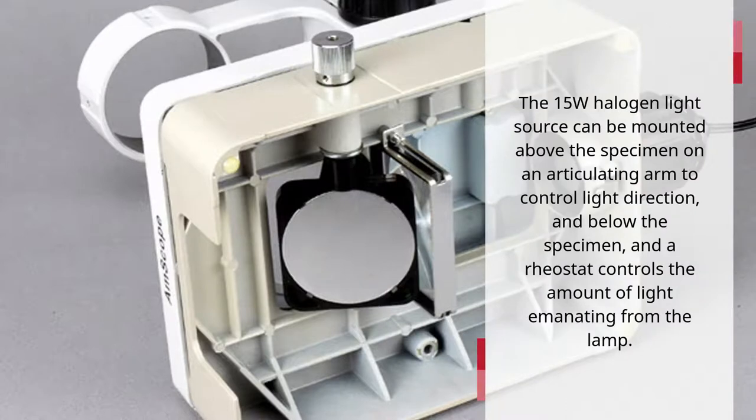The 15-watt halogen light source can be mounted above the specimen on an articulating arm to control light direction, and also below the specimen. A rheostat controls the amount of light emanating from the lamp.